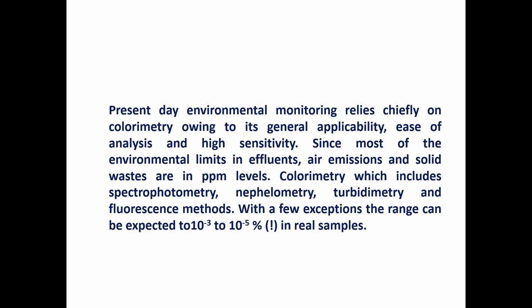So, what I want you to know, especially in this situation, is that the sensitivity range itself decides whether you should go for spectrophotometry or not.